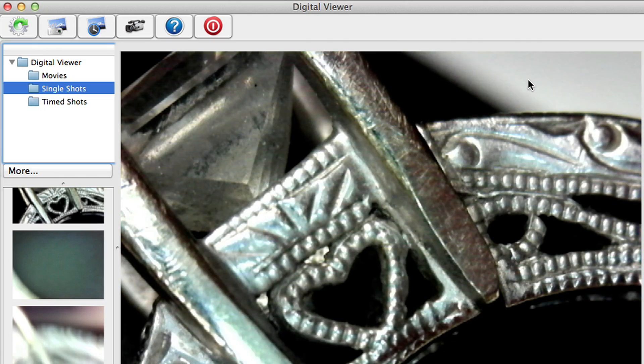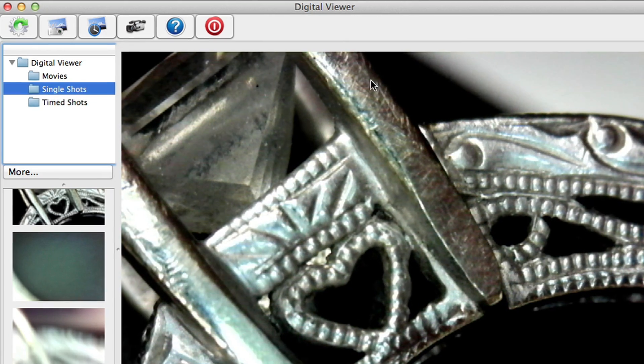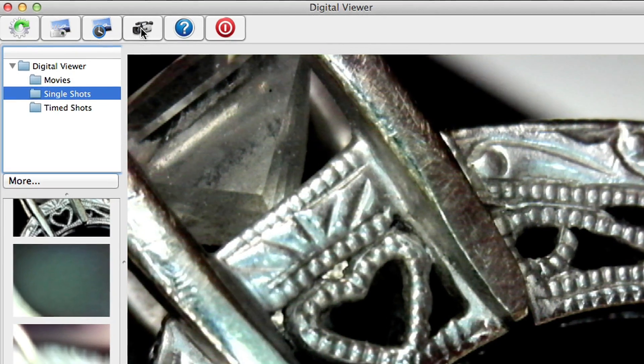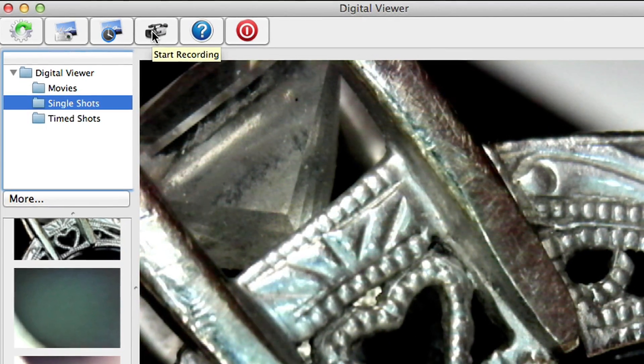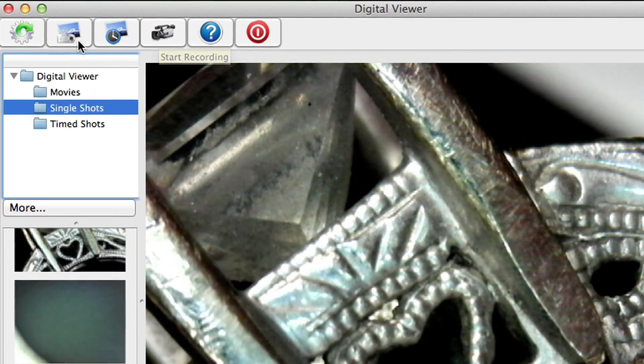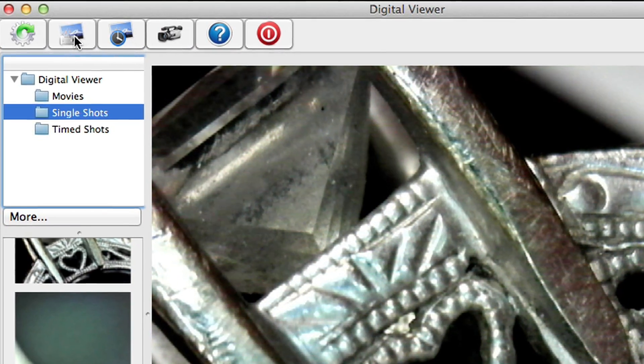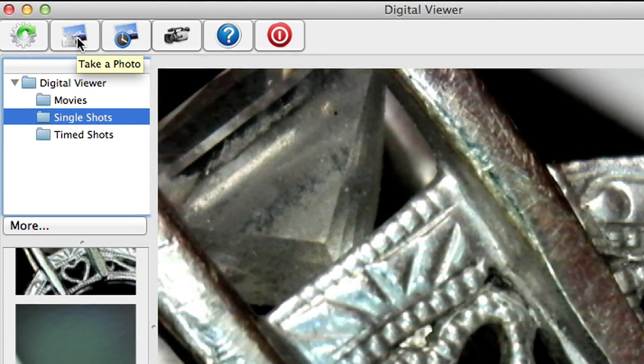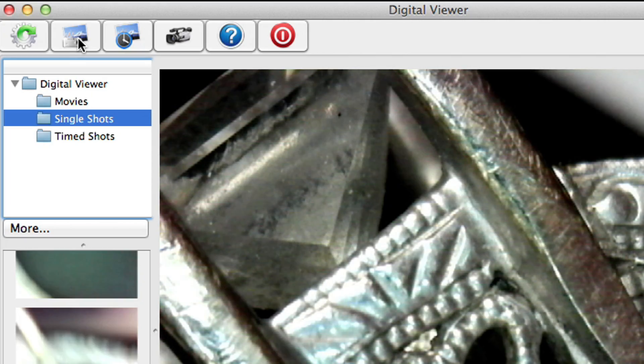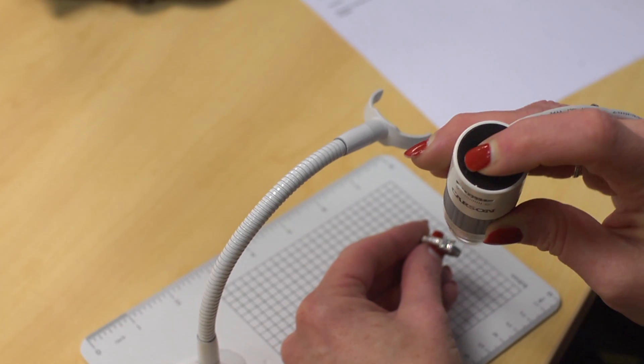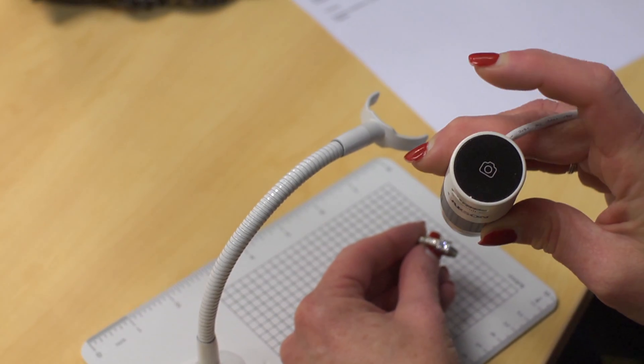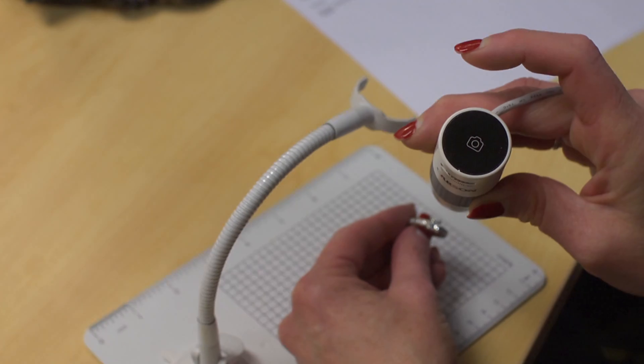While observing a specimen you can document your research at any time. Just click the camcorder button to record video and the camera button to snap a pic. You can even press the top of the eFlex for an instant photo.